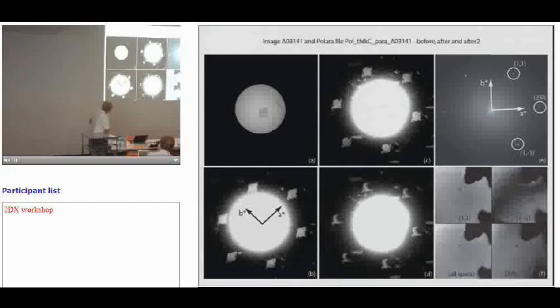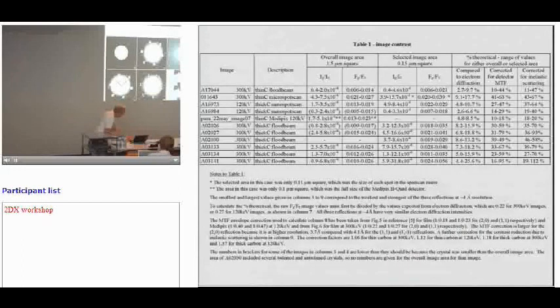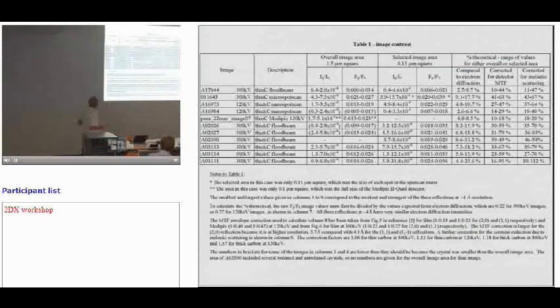And you can see it includes one of these little bits that are burnt in the crystal. But it's fairly homogeneous for the 1-1, fairly homogeneous for the 2-0. And then, of course, there's a 0 because it might have a defocus 0 or a beam tilt 0 or so on. But actually, it's pretty homogeneous. And then the final thing is this rather complicated. This is something like 10 images that we've taken.